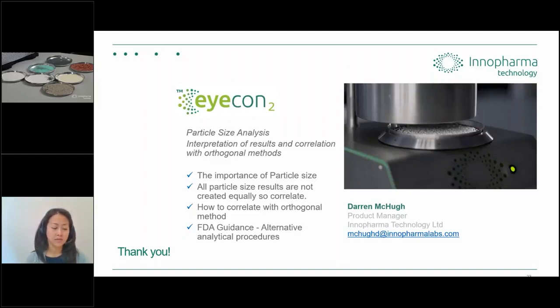We don't have a case study for flour. We have done a lot of milling integrations with pharmaceutical integrations, such as roller compactors, the exit of a mill there, which has all been excipients. But we would be up for a trial on a flour process once it was free flowing. I see no issue. Thank you.